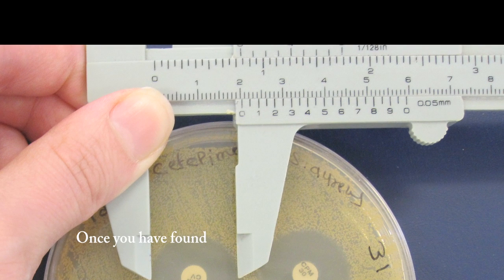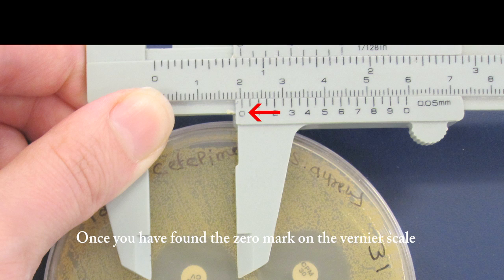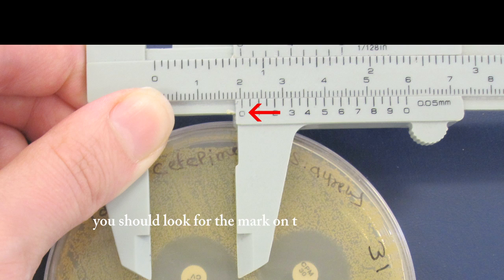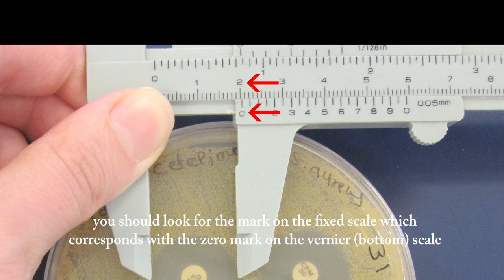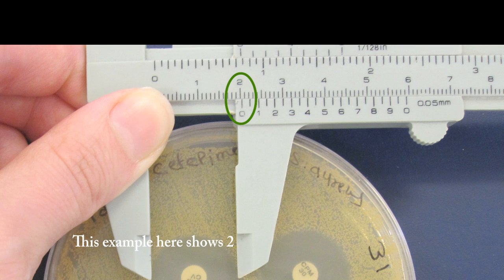Once you have found the zero mark on the vernier scale, you should look for the mark on the fixed scale which corresponds with the zero mark on the vernier bottom scale. This example here shows 2cm, that is equal to 20mm.